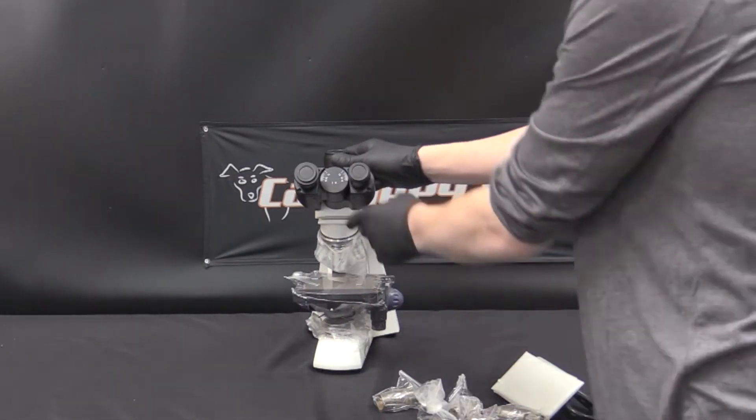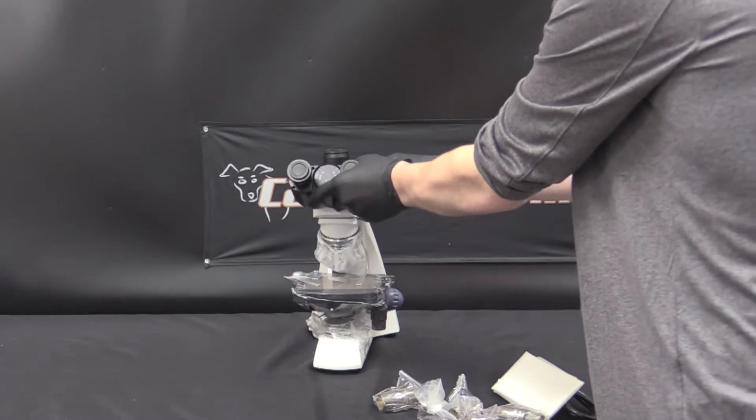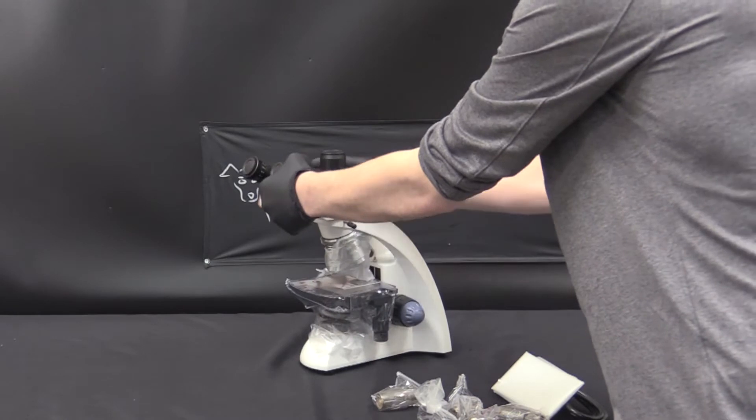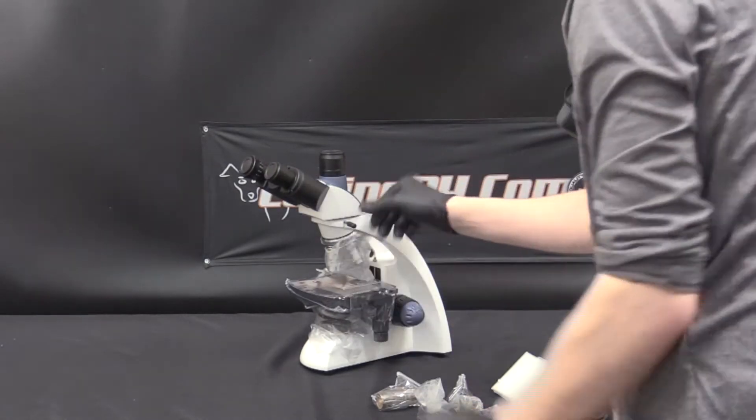To install the head with the binocular lenses, we're just going to place it on top like that and then tighten down the set screw until it's firmly in place. It should only take a couple of turns.